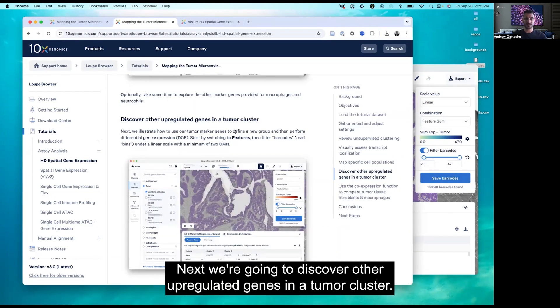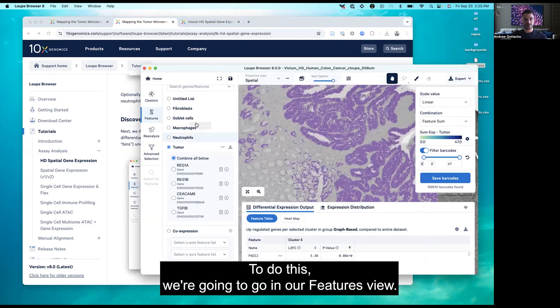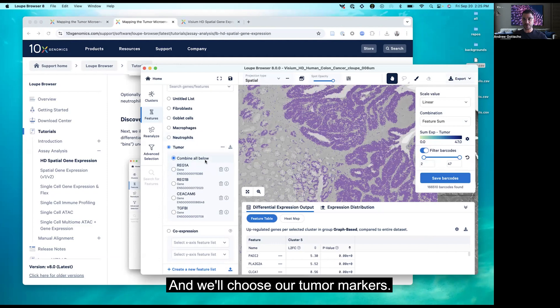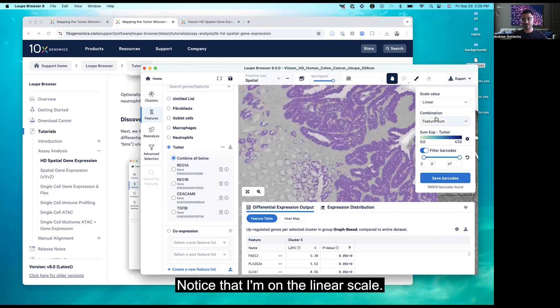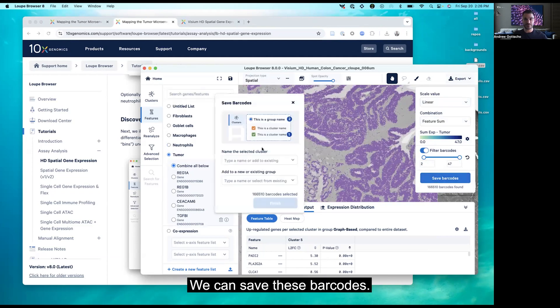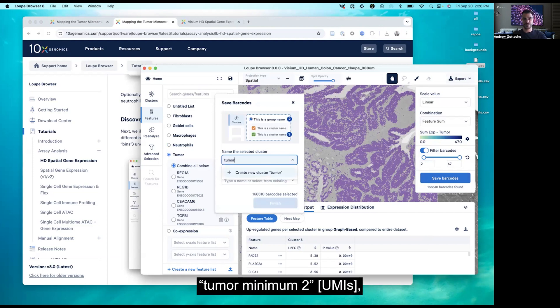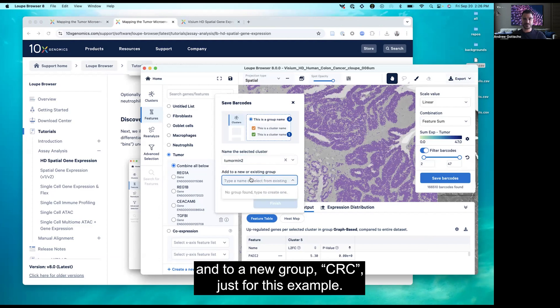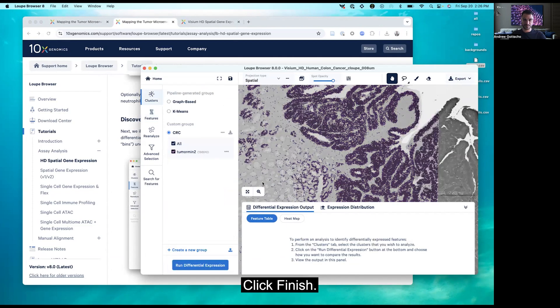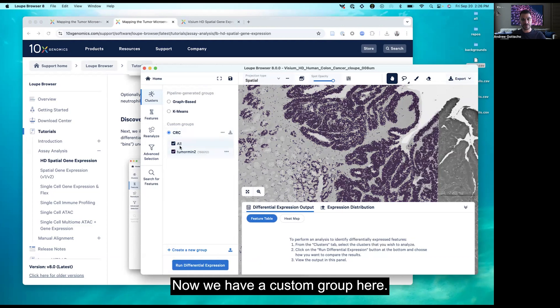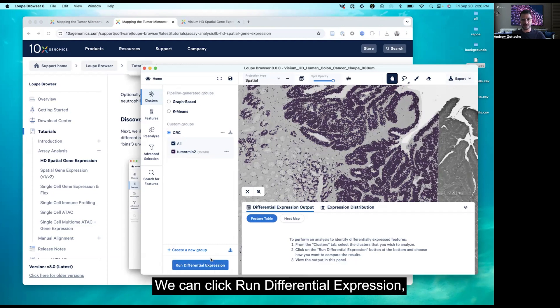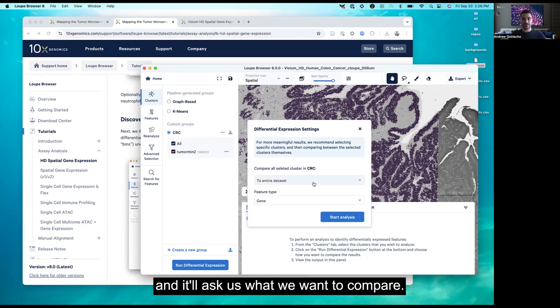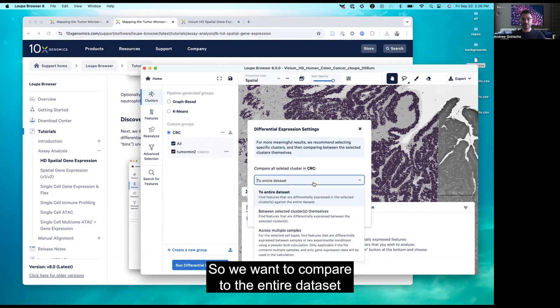Next we're going to discover other upregulated genes in a tumor cluster. In the Features view, choose the tumor markers and turn on Filter Barcodes with at least two UMIs. Make sure you're on the linear scale. Save these barcodes — we'll call it 'tumor minimum two' in a new group called CRC for this example. Click Finish. Now we have a custom group, and we want to look at what other genes are differentially expressed in these tumor cells. Click Run Differential Expression, and it will ask what you want to compare — compare to the entire dataset and hit Start Analysis, then Continue.